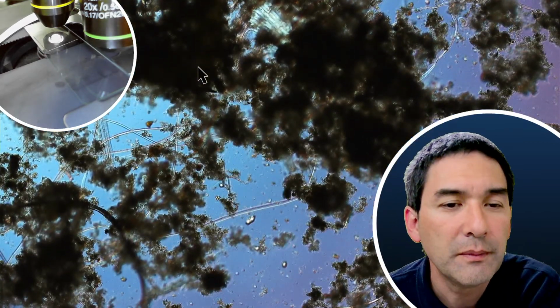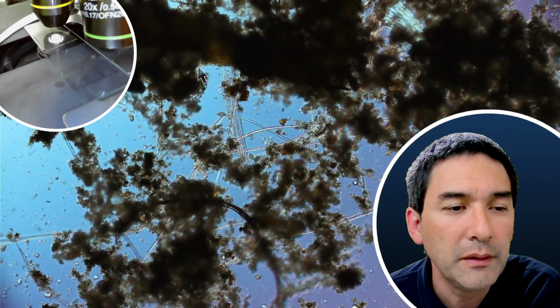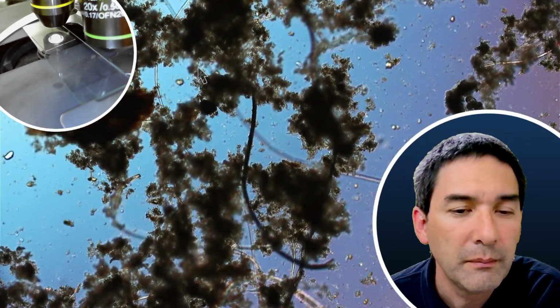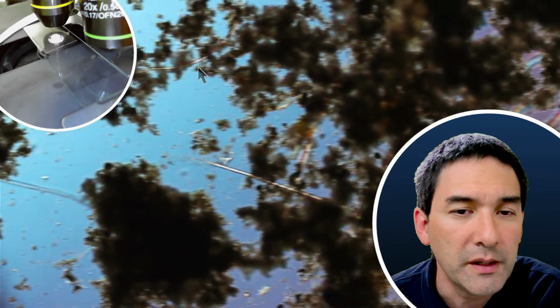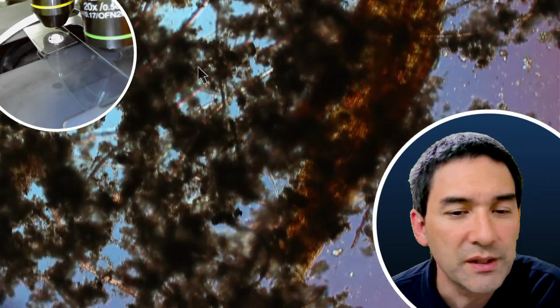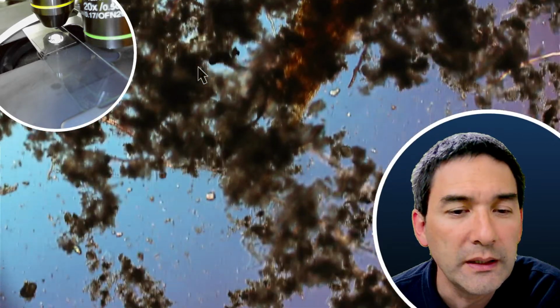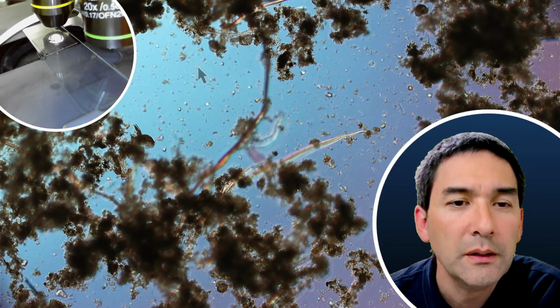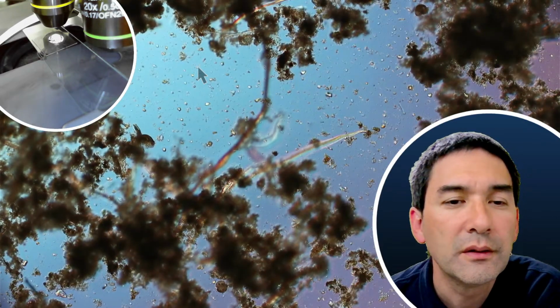Every time you see different things. I spent quite a bit of time to observe this. I'm just going through the whole thing quite quickly. And what is this here?